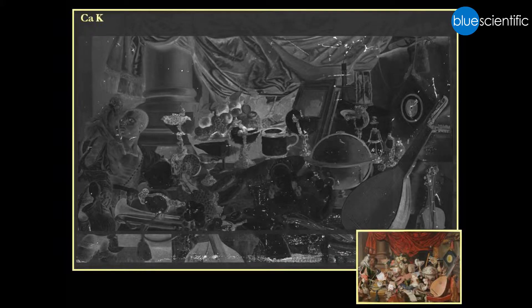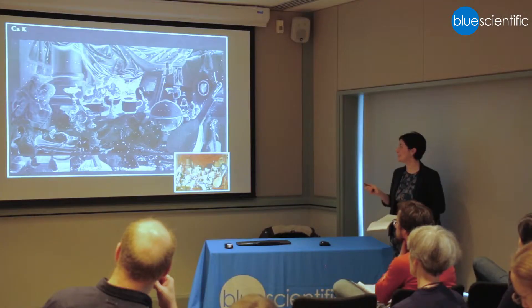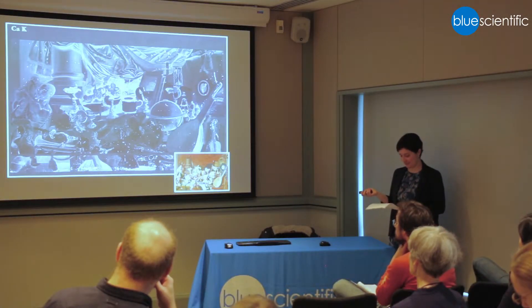Finally, the calcium map, among other things, shows the conservation treatment — all the infills that were added to the painting.